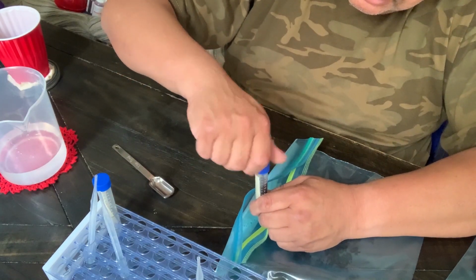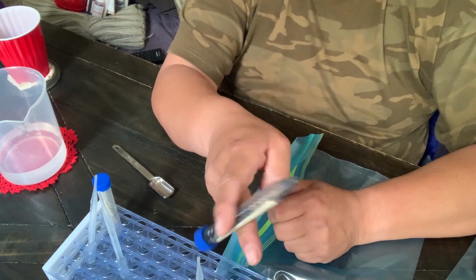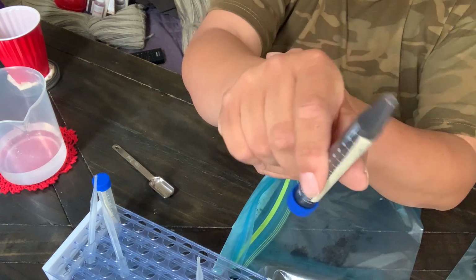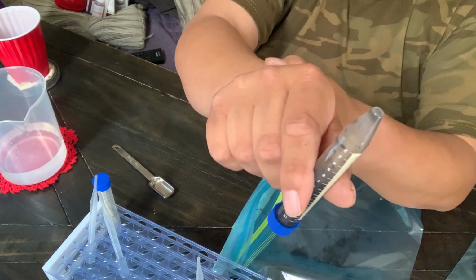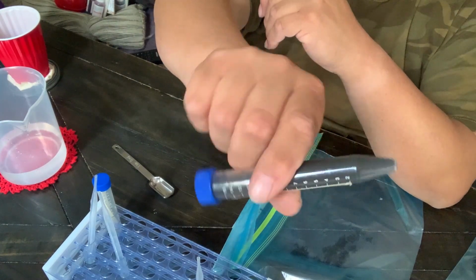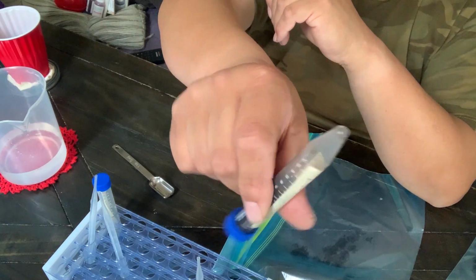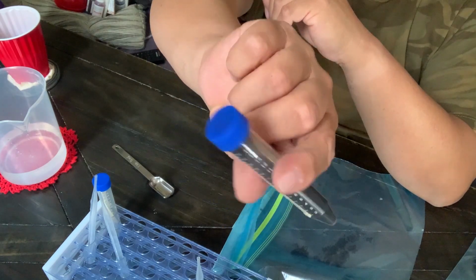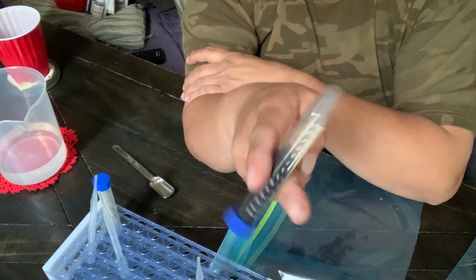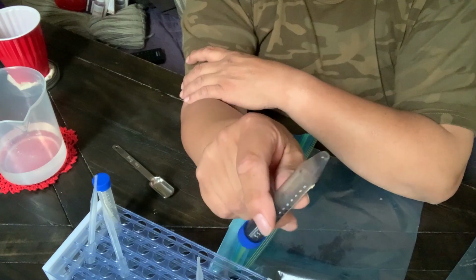Put the cap on and we do the same thing. Nice gentle roll. Again, we don't want to do a hurricane violent shake because remember these are microbes, they're very small. And you just see how it's getting nice and mixed in there. And again, you just do this for 1 or 2 minutes.